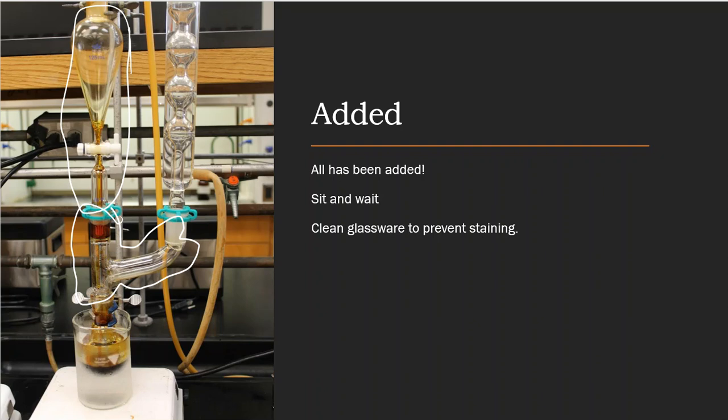And then it says, take this reflux and just directly attach it to that boiling flask. That way, this can keep doing its thing while I wait. I don't have to worry about it leaving or escaping. And then I can go rinse this and come back to it when I'm ready.